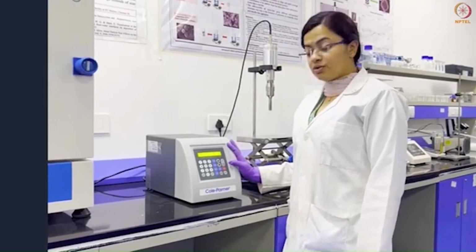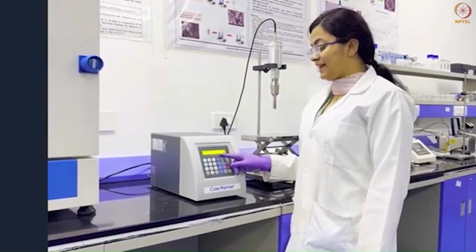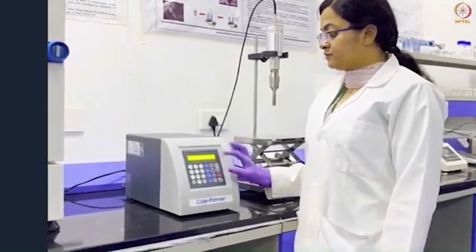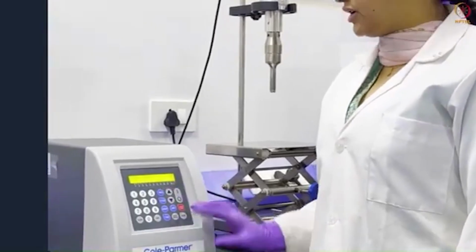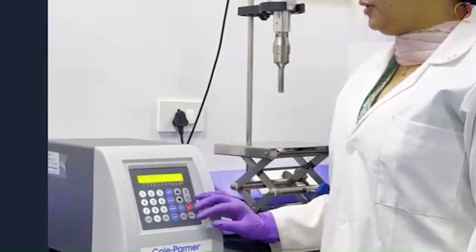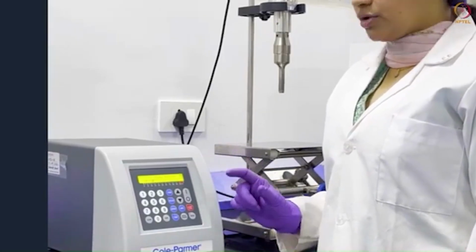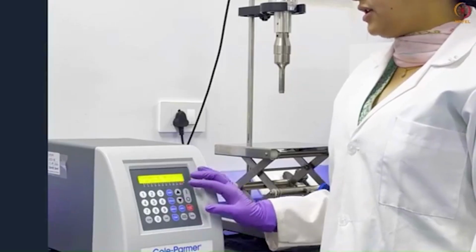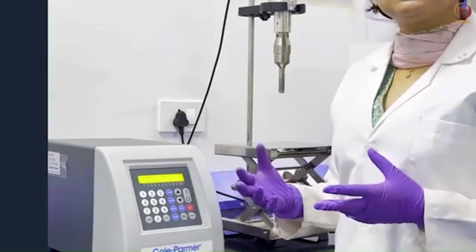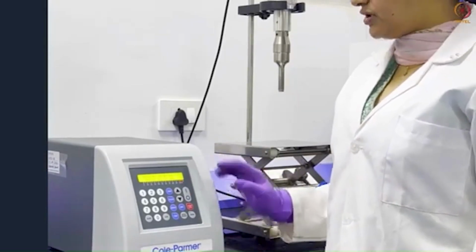As the display shows here, it shows temperature, time, temperature, pulse, and amplitude. Here is the 4 and 5 function that is attached to the probe sonicator. Initially, the timer, which shows the duration of the ultrasonication process. Here is the pulser. It is usually used in biological samples, to turn the sonication process on and off.